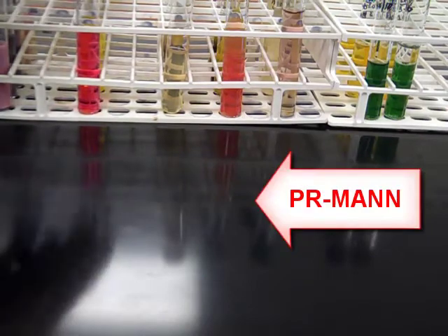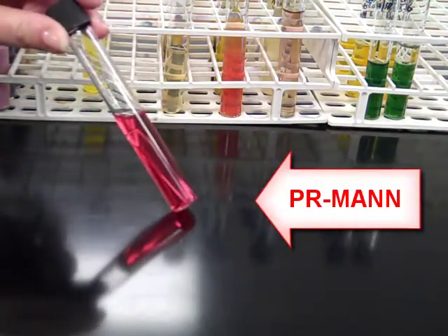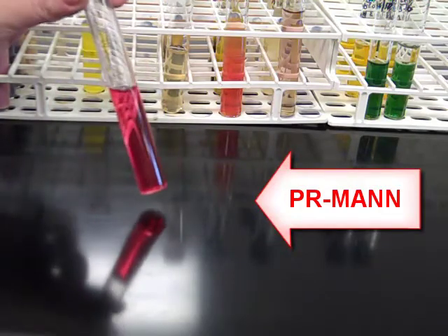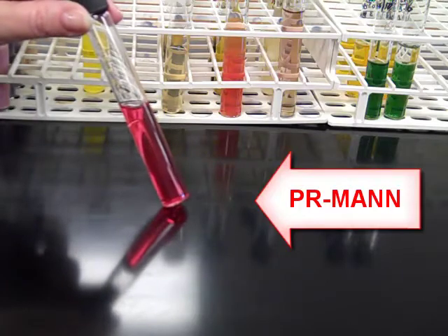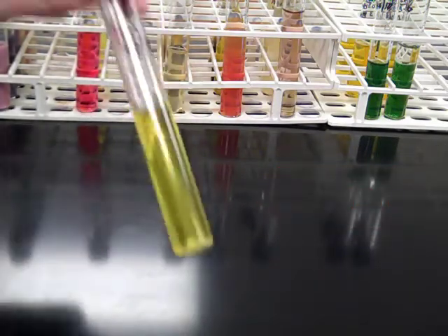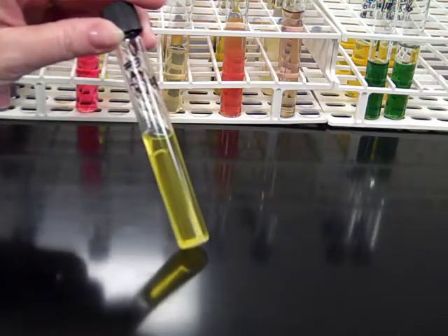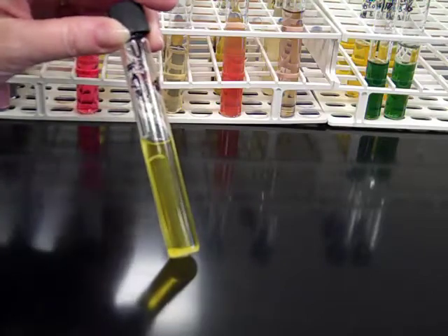The next tube we're going to be looking at is phenol red mannitol. Phenol red mannitol is a nice red color to start with. There's a Durham tube on the inside. We're looking to see whether the organism can ferment mannitol. If the organism is capable of fermenting mannitol, it will change to a yellow color — you will get a yellow result.